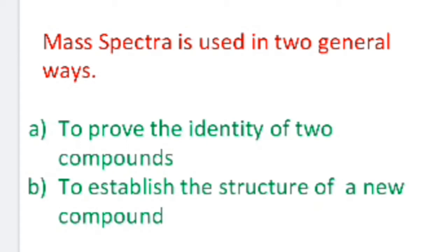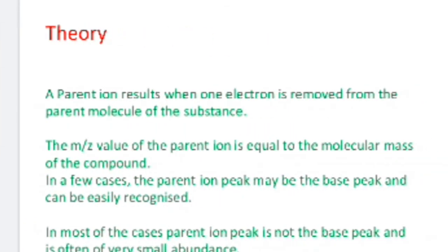Not only to determine the mass, it is also used to prove identity and establish structure.